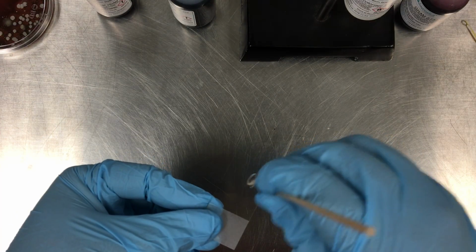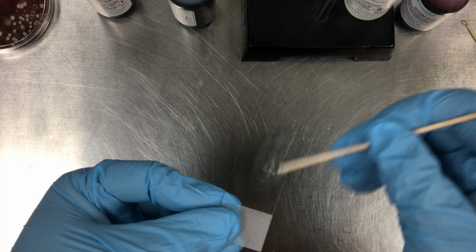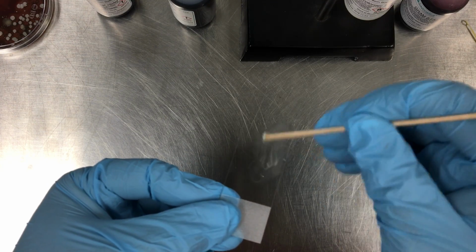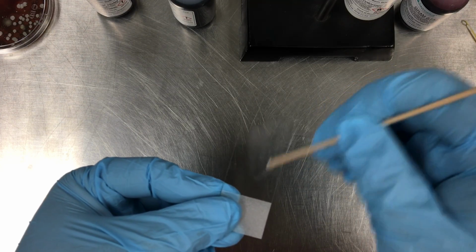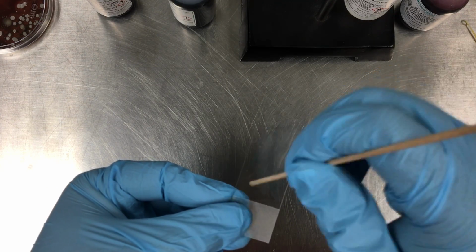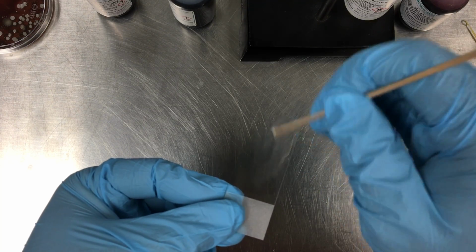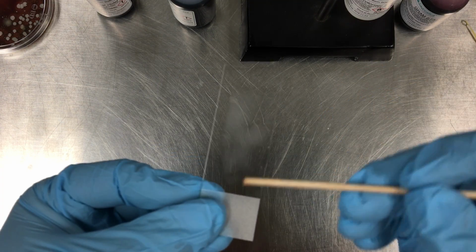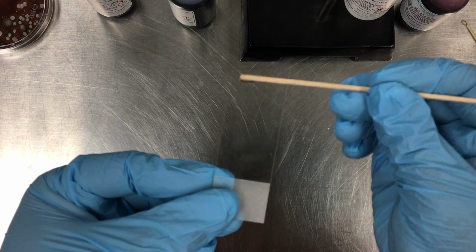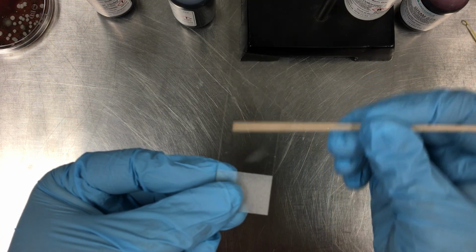So I'm going to mix it around with this drop of distilled water. The purpose of this is to make it more of a homogeneous mixture so it can be spread thin. If I didn't use the drop of distilled water and if I just tried to apply it to the slide, I would end up with thick, heavy streaks, which would be difficult to stain and look at under the microscope. So you can see I've made a nice, thin, homogeneous mixture of bacteria and distilled water, and I've spread it pretty evenly across the slide.